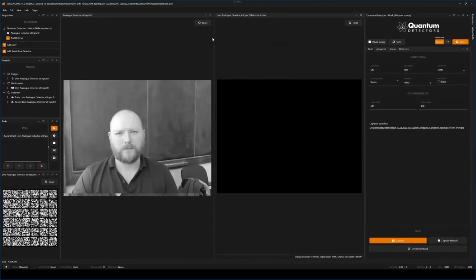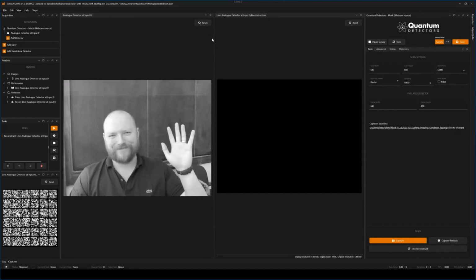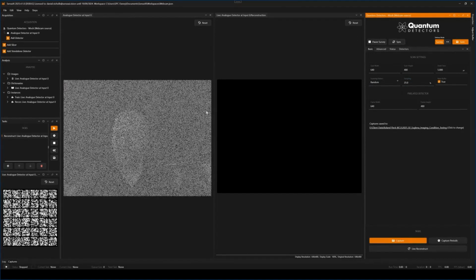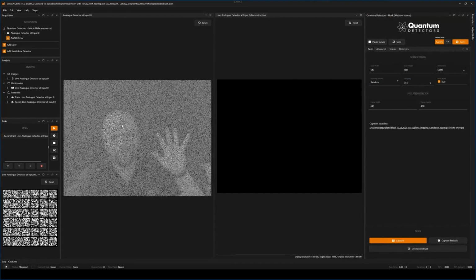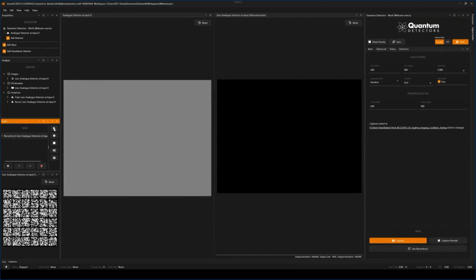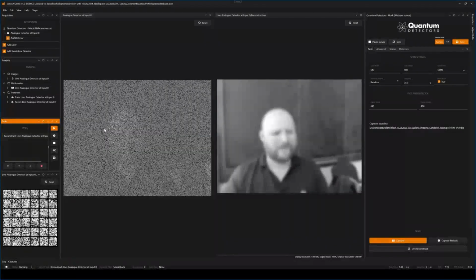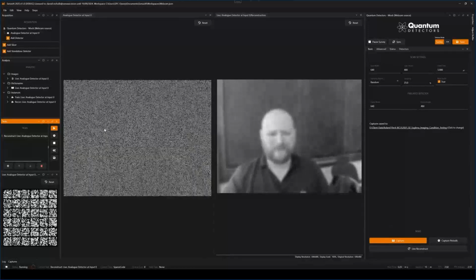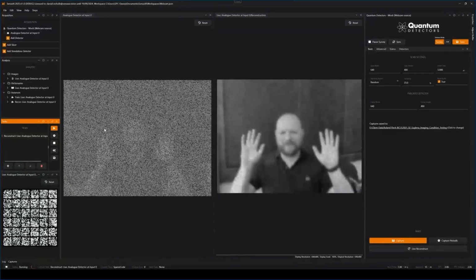Finally, here is a demonstration of using a webcam as a mock scan generator. First, we can see what imaging using a traditional raster scan might look like, and at these settings the frame rate is rather slow. By only changing the sampling pattern and sampling rate, an immediate frame rate increase can be seen, and at 25% sampling, this corresponds to a 4 times increase in frame rate.